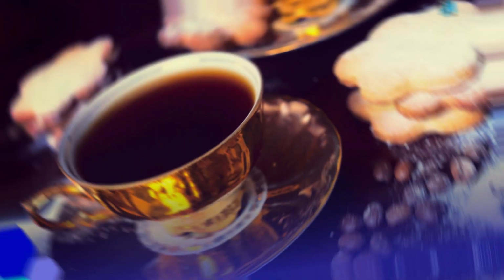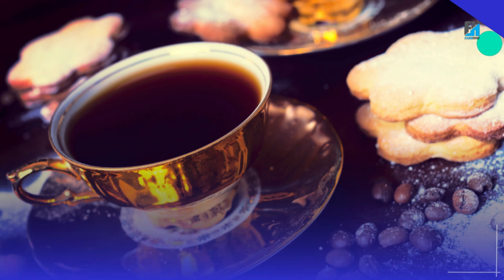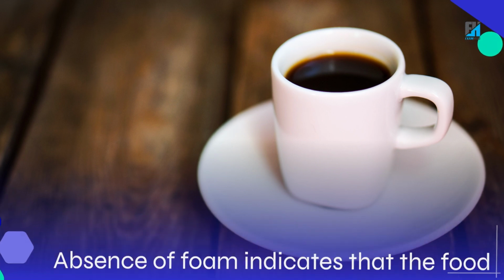Proteins. Foam test: a very simple test for the presence of protein is to dissolve the food substance in water and shake vigorously. If a foam is produced, it shows the presence of protein. Absence of foam indicates that the food substance does not contain protein.